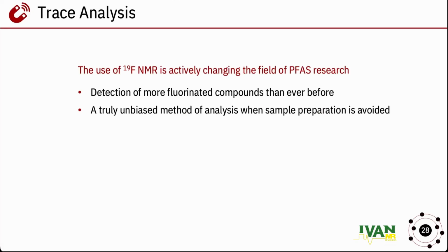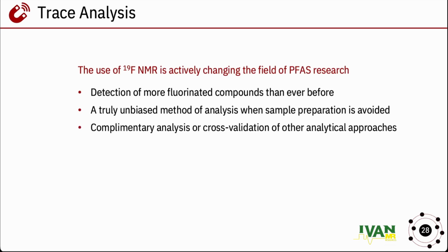It's an unbiased method of analysis. It's somewhat non-destructive. Adding the chromium or the gadolinium does make it more of a destructive method, but you can still take the sample and use it for something else. But critically, we're not trying to replace other techniques. We're trying to enhance them, adding cross-validation or complementary analysis. And as I said, we're finding new things every day, which is a little bit scary, the amount of PFAS we're finding out there, but it's also really beneficial to furthering our understanding of these global contaminants.